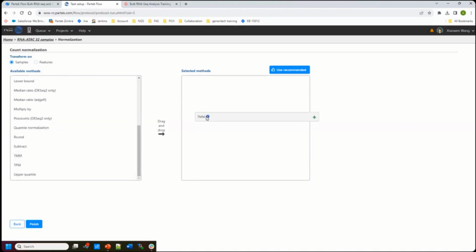When you build your normalization method and use TMM, make sure that you deal with the zeros. I would recommend adding an offset and then performing TMM. Remember, we always have zeros.